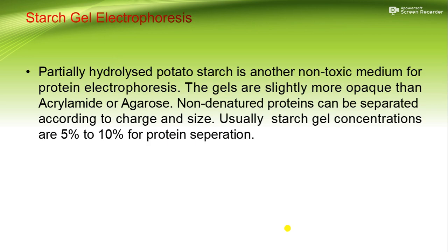Starch gel electrophoresis. Partially hydrolyzed potato starch is another non-toxic medium for protein electrophoresis. The gels are slightly more opaque than acrylamide or agarose. Non-denatured proteins can be separated according to charge and size. Usually starch gel concentrations are 5% to 10% for protein separation.